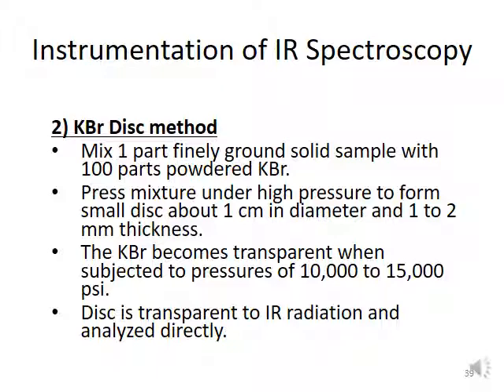After it is pressed, the disc can be scanned using infrared spectroscopy.